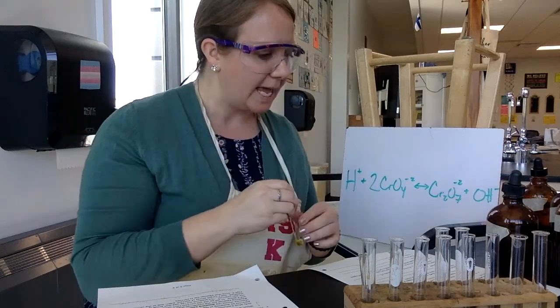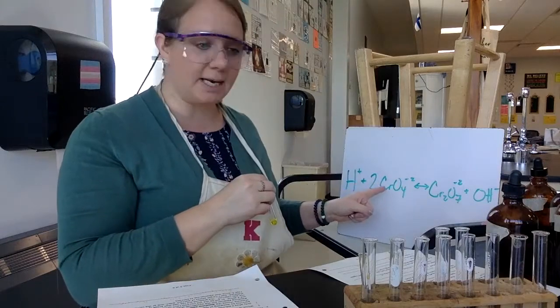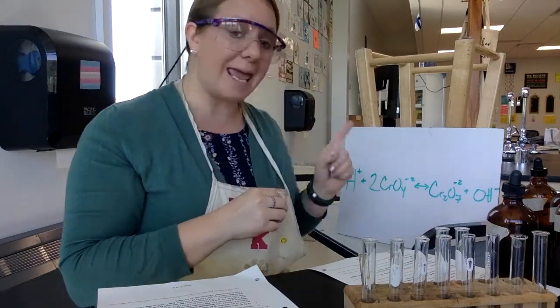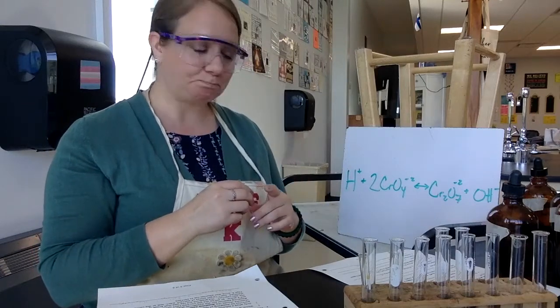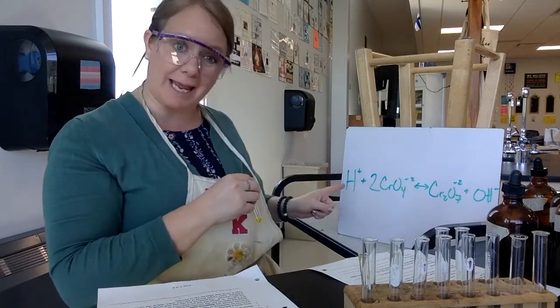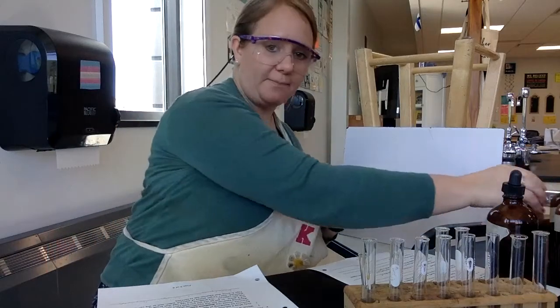So starting with that. And then it says that I'm going to add some HCl to it. So go ahead and make your prediction about what you think you will see. I'm starting with CrO4 and I'm adding H. All right. Okay, let's see what happens.